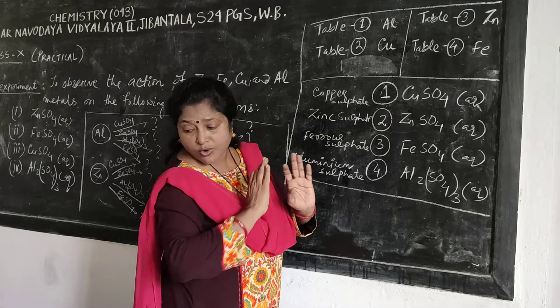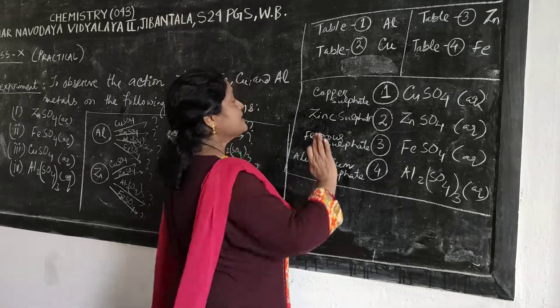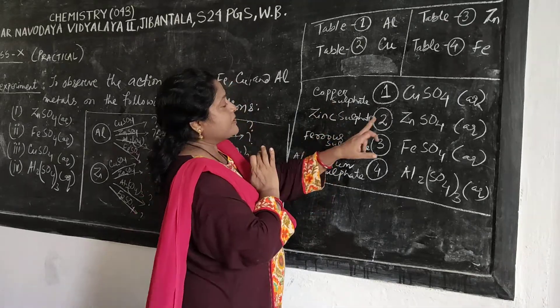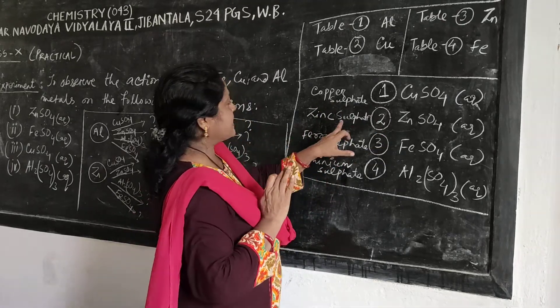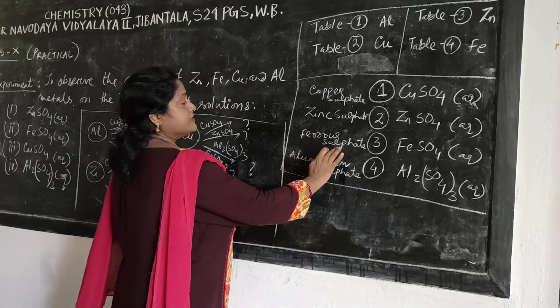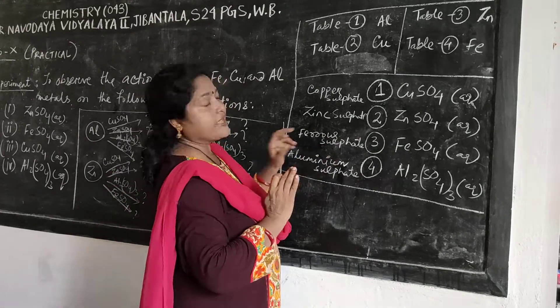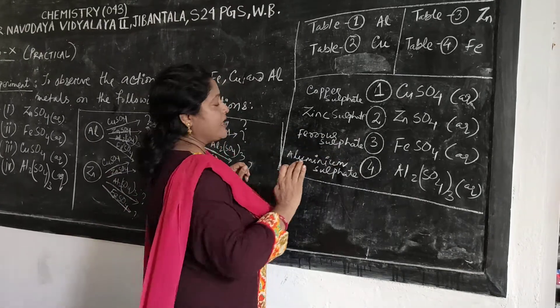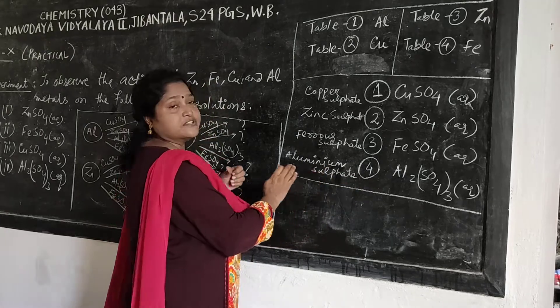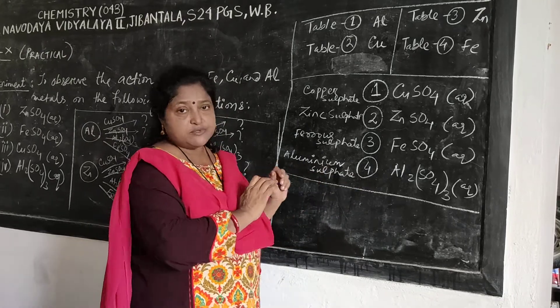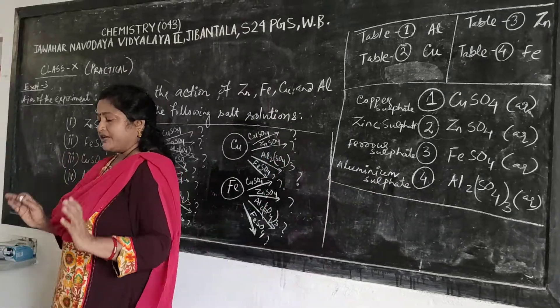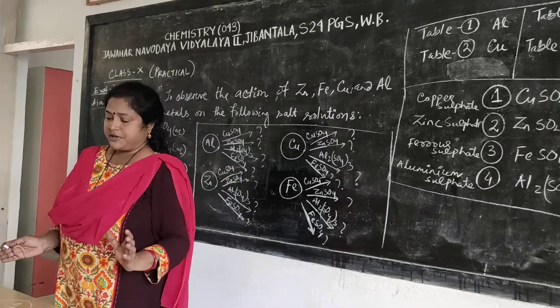Beaker 1 for all the tables is copper sulfate. Beaker 2 for all the tables is zinc sulfate. Beaker 3 for all the tables is iron sulfate. And beaker 4, last but not the least, is aluminium sulfate. So, we are here with the experiment.